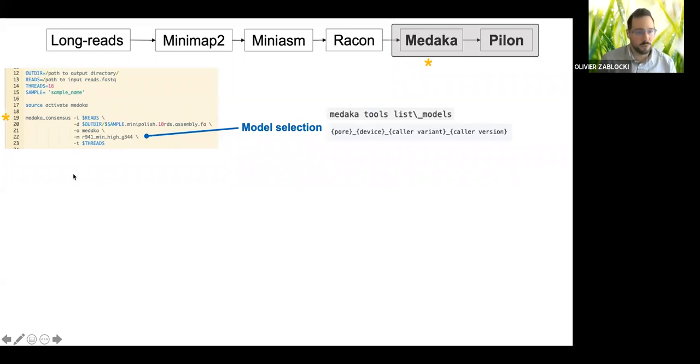And lastly, you run the number of threads, and it will attempt to correct solely based on, I suppose, it tries to reapply or check the model predictions on your called data. In my experience, it adds maybe 1% accuracy, which is non-negligible.